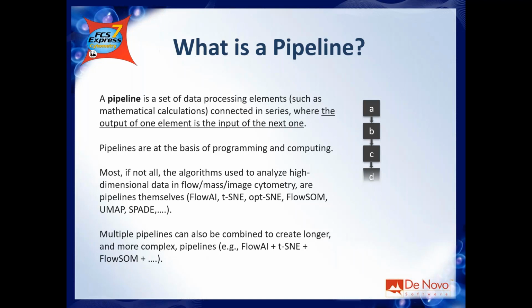Also, I would say, not all, but most of the algorithms used in flow cytometry for high dimensional data analysis, I mean flow cytometry, mass cytometry, image cytometry, are pipelines themselves. Okay, they are usually provided as a standalone algorithm, but they are pipelines themselves. And just to mention a few, FlowAI or tSNE, FlowSOM, UMAP, whatever.